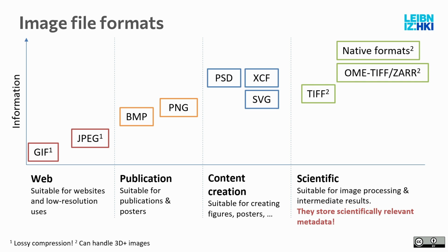And these are important that you keep them around. The top one is the native format that your microscope will produce. So, for example, Zeiss microscopes will produce CZI formats. These contain the most information of all because they're literally from the microscope manufacturer and they store all kinds of metadata inside, including what lasers you have used and the colors and so on.